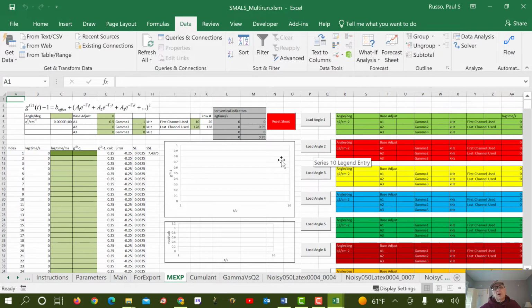What we're going to do is designed to slow you down. You could go ahead and just fit all of them at once, and then you'd have a big mess. But it's designed to make you look and think. Let's reduce the number of channels that we're fitting. We'll go from 15 to 128. You're floating a baseline, so it's not really critical how many channels that you use in a nonlinear least squares fit. That's kind of nice things about it.